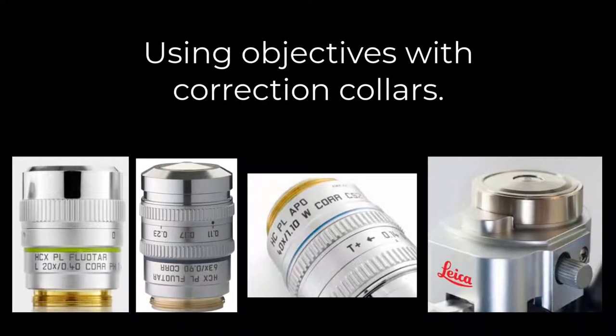Today we will demonstrate how to adjust correction collars and iris diaphragms on various objectives. Many objectives have correction collars that should be adjusted to achieve the best image quality — it's as important as focusing onto your sample. If you see that an objective has an evenly spaced value marked above a knurled collar, or simply has an adjustable ring, it is most likely an objective with a correction collar. If it's your first time using the objective, you should ensure the correction collar is adjusted for your sample.